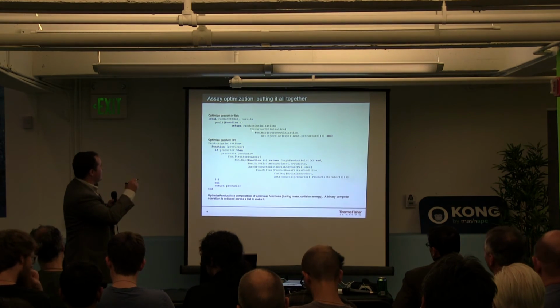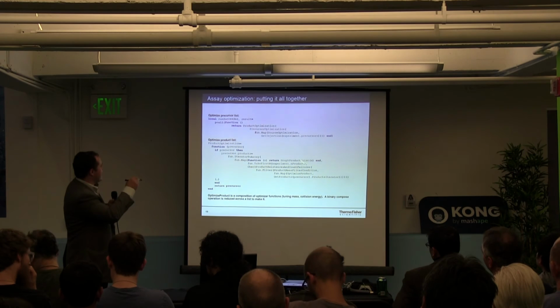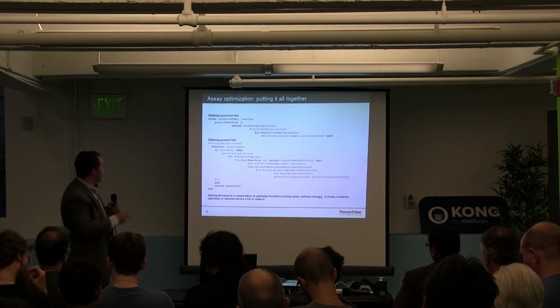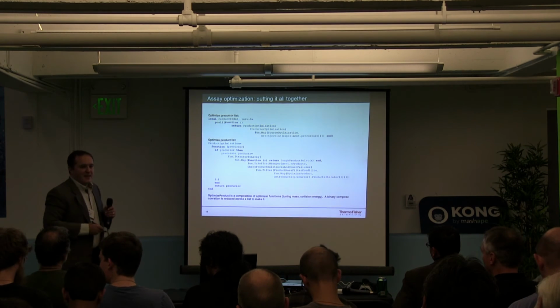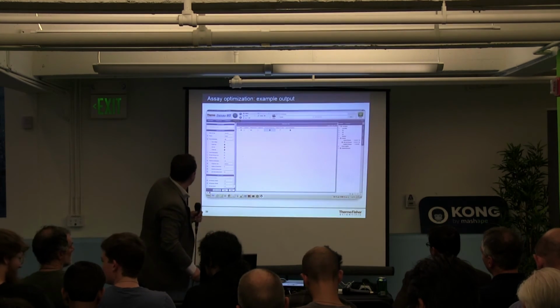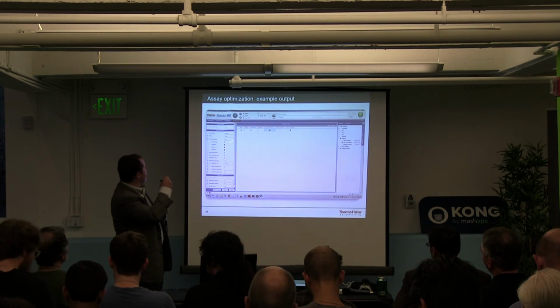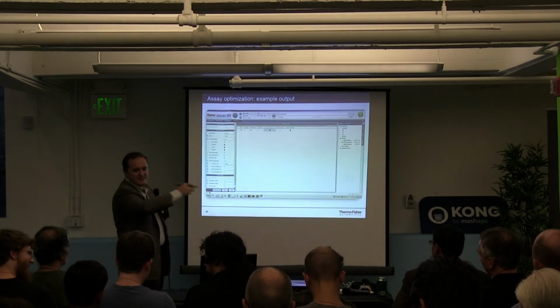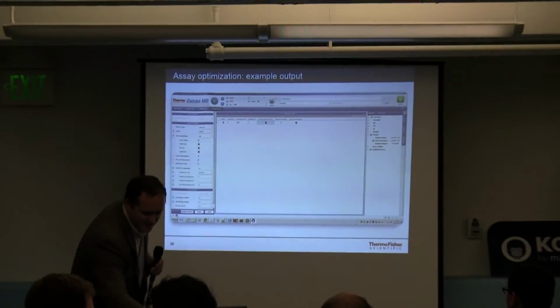And then we do the product optimization, which looks at the products iterator that's generated from each of these precursors. And the user can configure this all pretty much at will. The GUI has a table of options. Each checkbox is inserting a function into the composition to build this up.